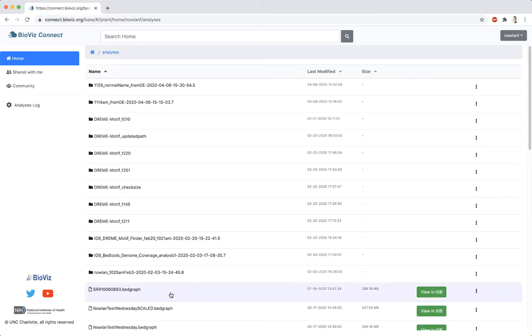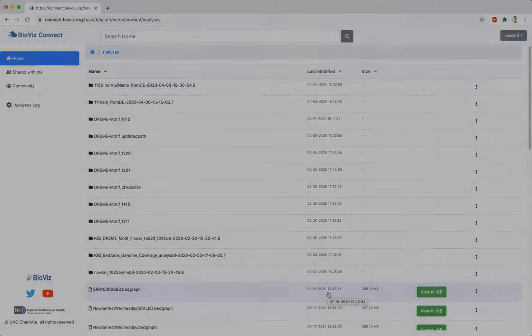Note that analyses can be run on any file you have read access to, and that any files output from an analysis are owned by you.